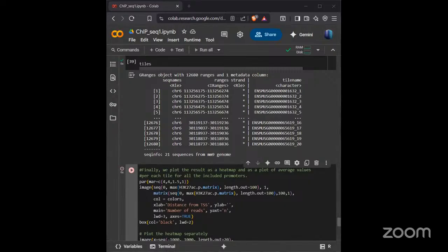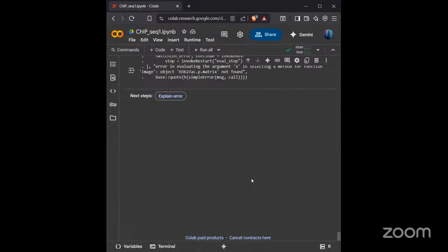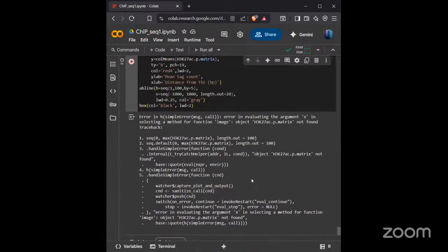One moment. Let me check if I missed something. You should run this together. I think that is the error. Okay, I missed something. This is my mistake.